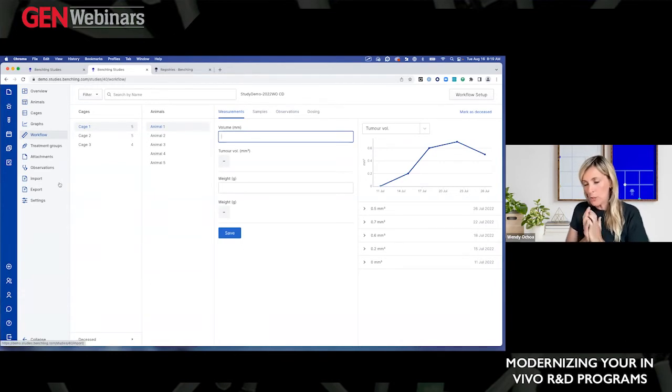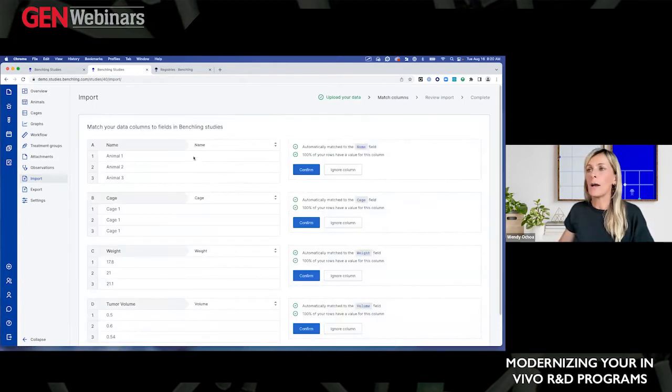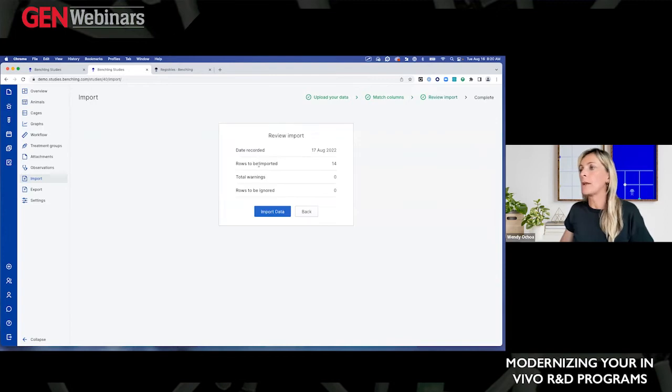Another way to import information into the studies would be in bulk. So imagine that you are using an instrument that produces a particular type of tabulated file with the data. You can always bring this information, associated with the day you collected the data, drag that file into studies, and all you have to do is confirm that the columns, the information in your file, correspond with the information you are capturing in studies, and that information will be automatically aggregated to those animals, and again, updated live and visible to other members in your team.